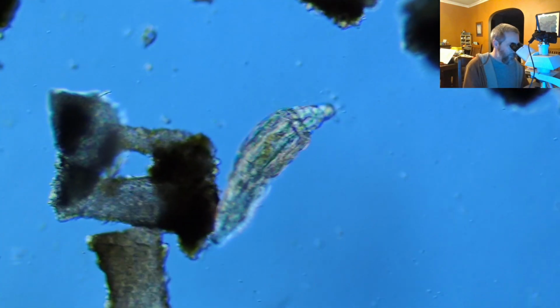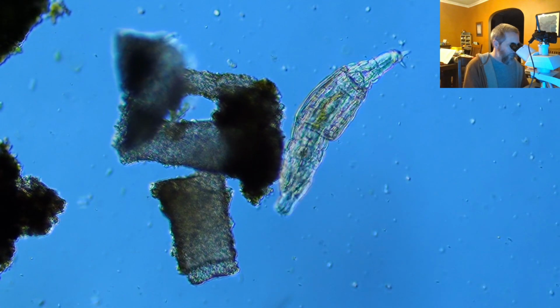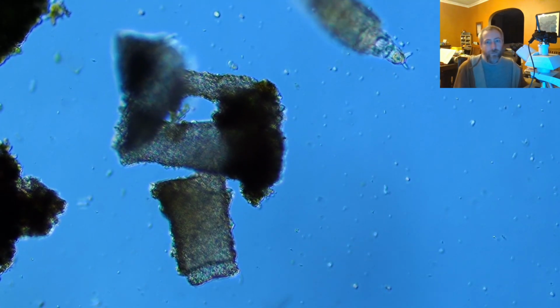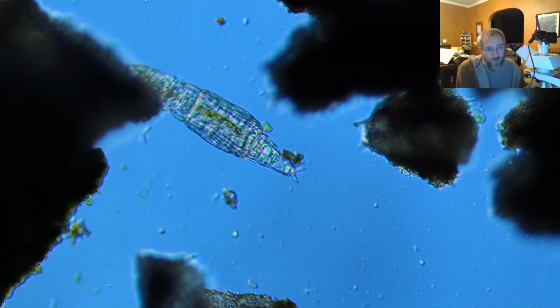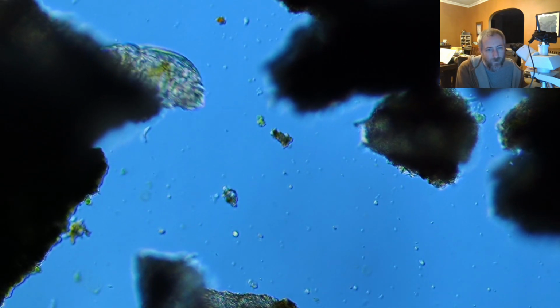So, here's the other one right here. It's just hidden behind that thing, but those two are immensely different from each other. It's possible that it might be a baby, but it's probably actually a different species. And then this, you can see the claw on the rotifer now really well.